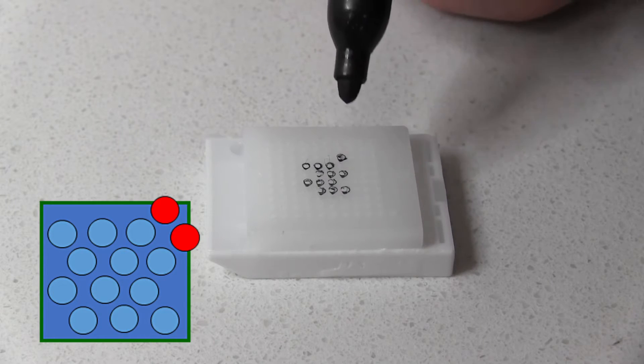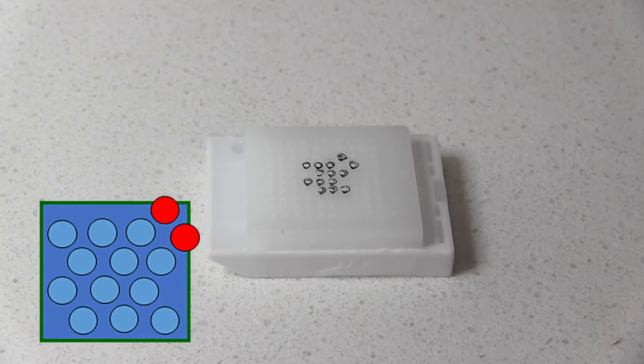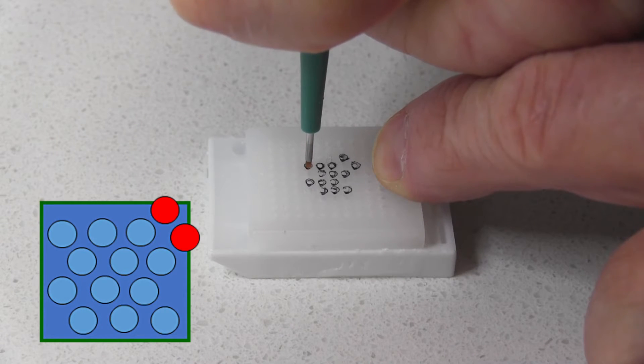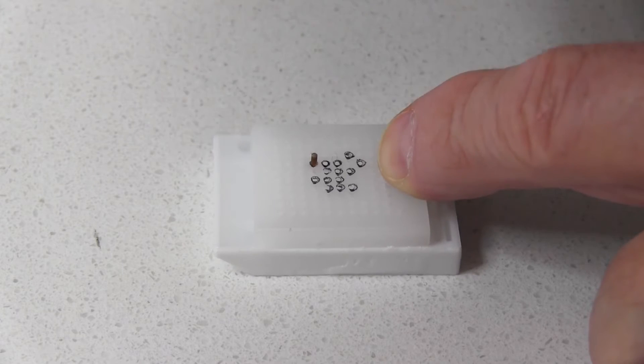Now we can begin to fill the TMA block. As you can see from the markings it makes it really easy to see the exact location you will be inserting the tissue cores in.